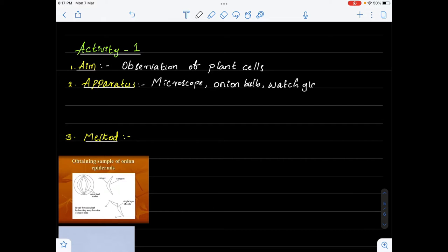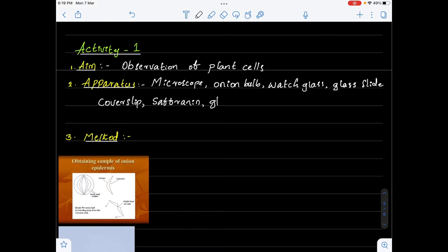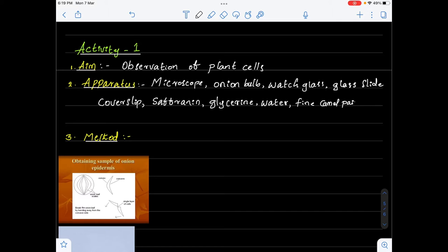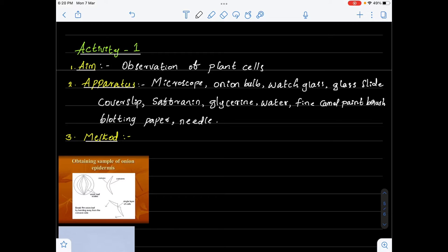Additional materials required are: glass slide, cover slip, saffronin, glycerin, water, fine camel paintbrush, blotting paper, and needle. These are all the materials required to perform this activity.